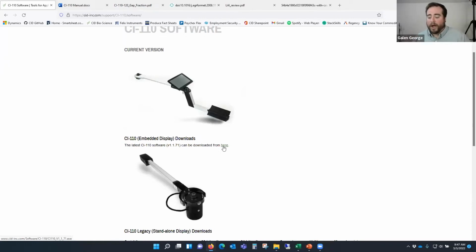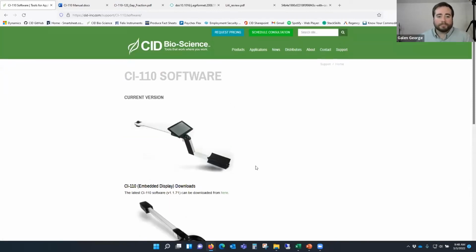It simply requires connecting your instrument to the same wireless network as your computer, and then entering your IP address from your device into the software, and then it'll automatically upload that new software to your instrument. It's very convenient.